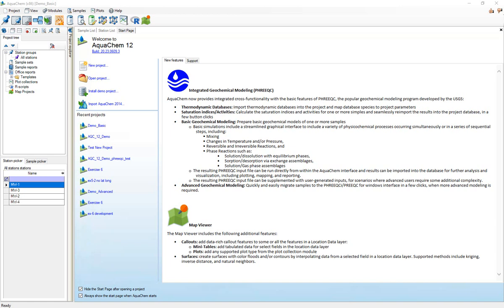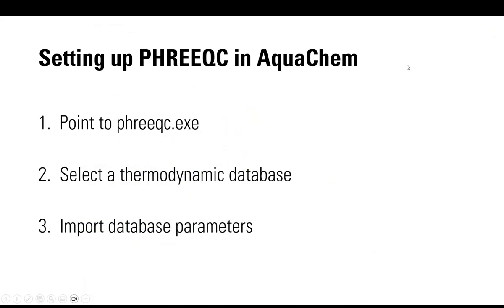This tutorial is not a tutorial on geochemical modeling. It's not even really a tutorial on PHREEQC. It's a tutorial strictly to get you set up and have PHREEQC working on your projects. So to use PHREEQC in AquaChem there are three essential steps.